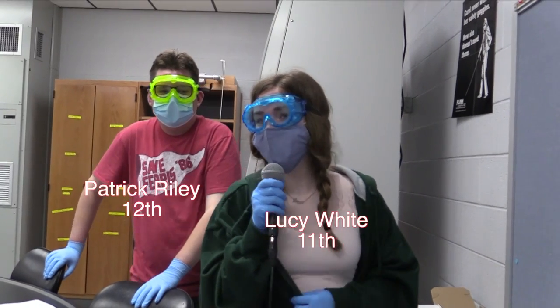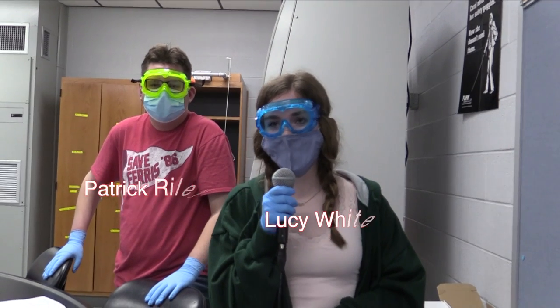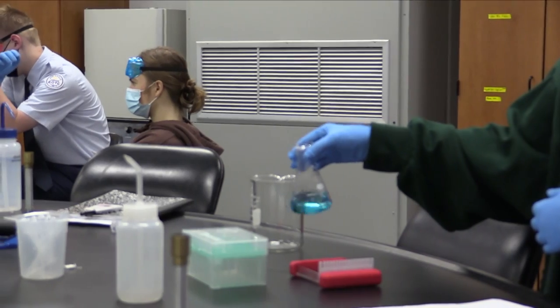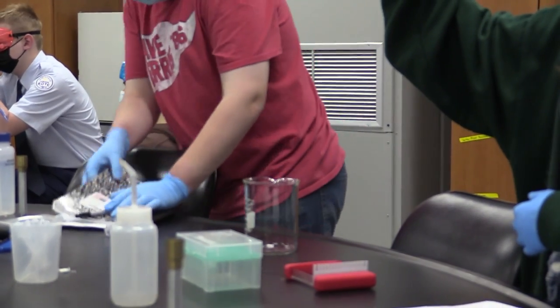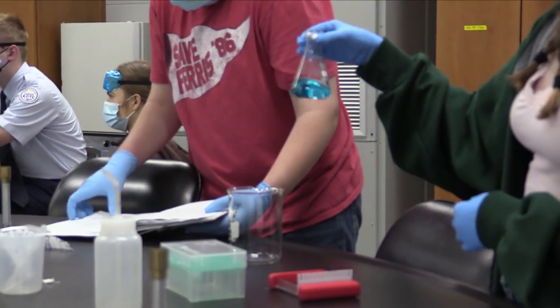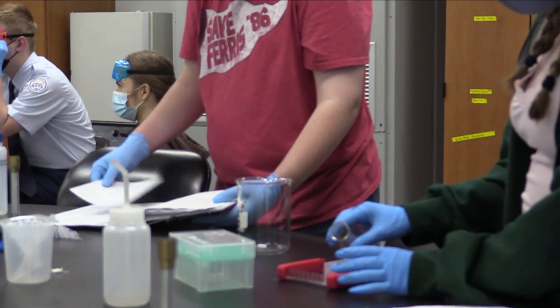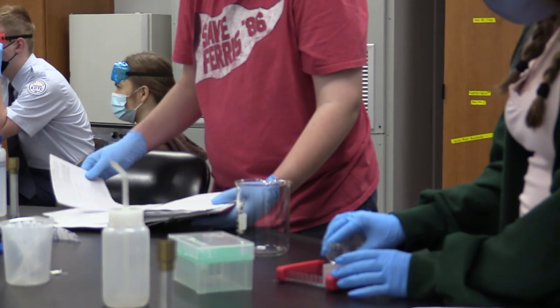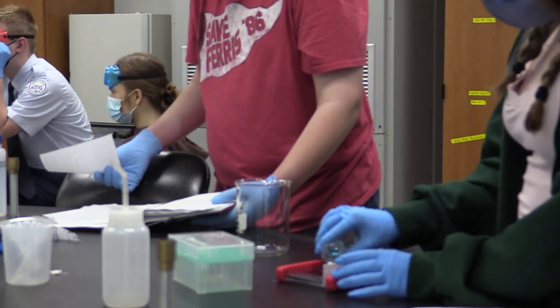Hi, so basically what we're doing today is we're casting a gel for an electrophoresis run, which is basically like running DNA so we can see it better. So today with our gel, we poured agarose into a glass beaker, and then we also added a Carolina blue stain so that way we can see it better, and we stirred it together and poured it in the casting tray so that way we can use that to run our gel.